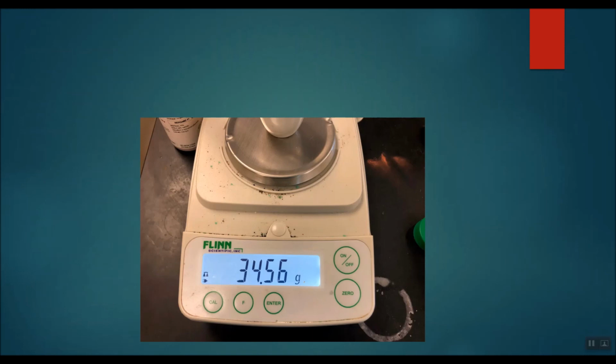So, am I done? The answer is no. Because how do I know that all of the copper has reacted? If some of that copper is unreacted, then my measurement is going to be wrong. So I think I've got it all reacted. It all looks black, but what if there's some copper underneath, or where I can't see, that has not reacted?